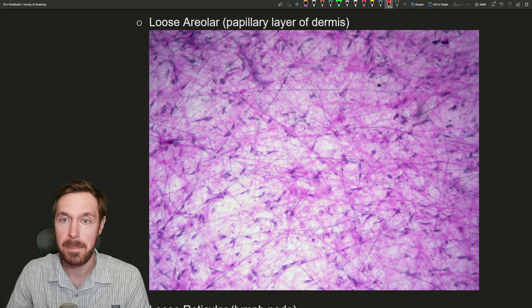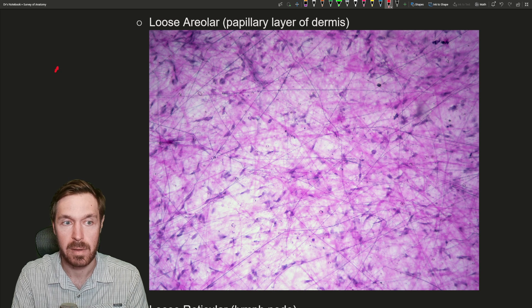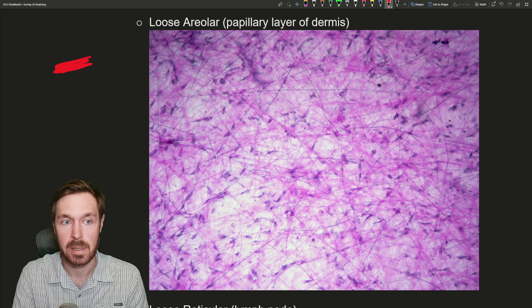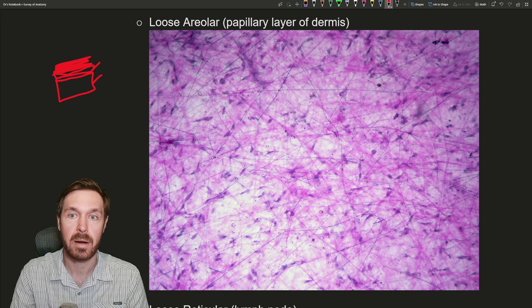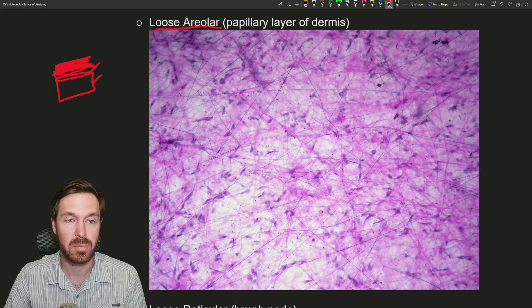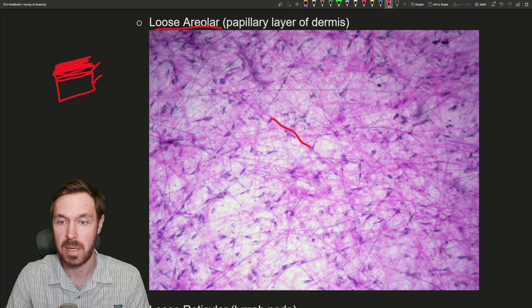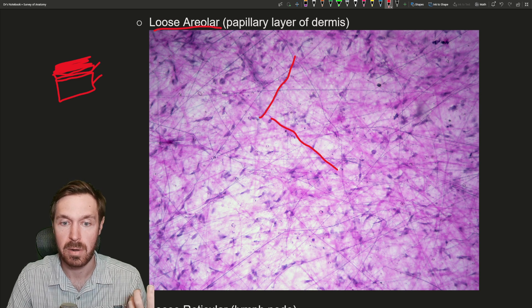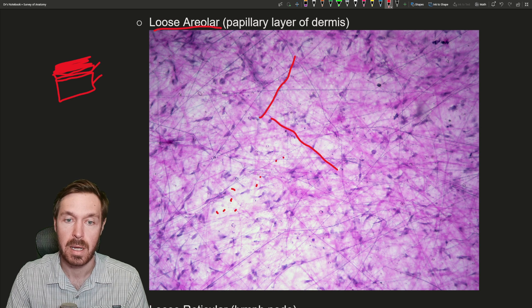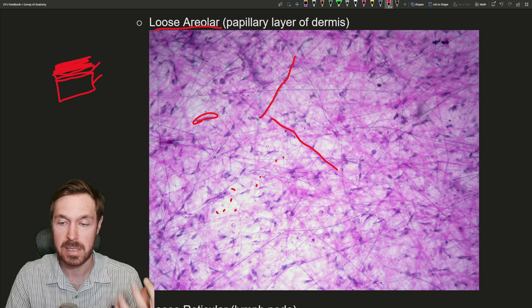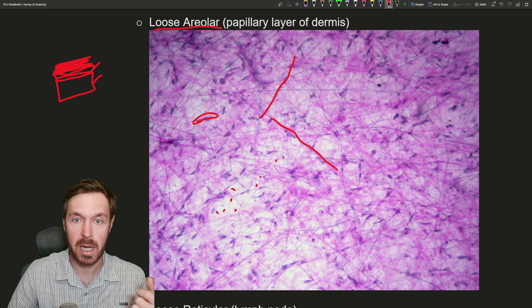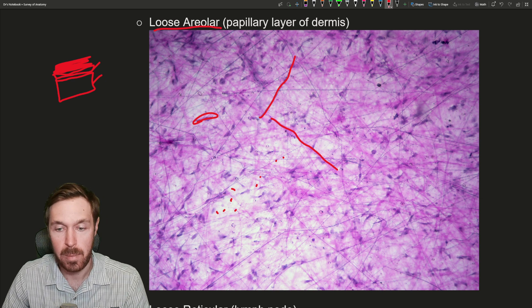Next is loose areolar, from the papillary layer of the dermis. When we have the skin, the epidermis is the upper layer and the dermis is beneath it. The dermis is broken into two layers: the papillary layer and the reticular layer. The papillary layer is loose areolar, which is the most abundant connective tissue — pretty much found everywhere. It's a mix of fibers: the pink fibers are collagen and the blue ones are elastic fibers. It holds a lot of ground substance and fluid, and fibrocytes and dendritic cells are found moving around in it. The elastic fibers give it stretch and recoil.